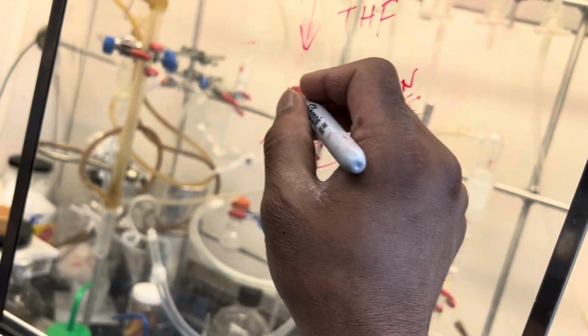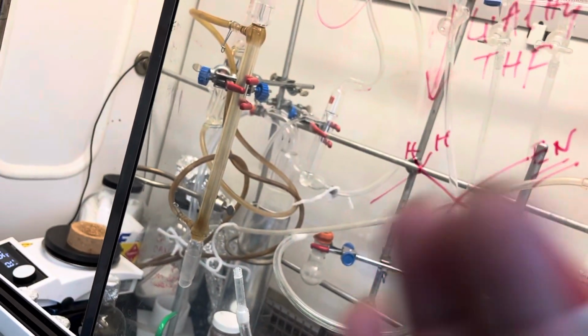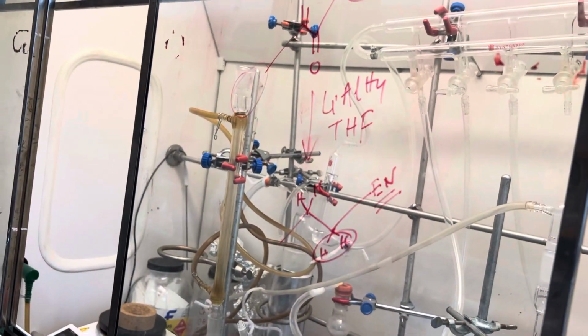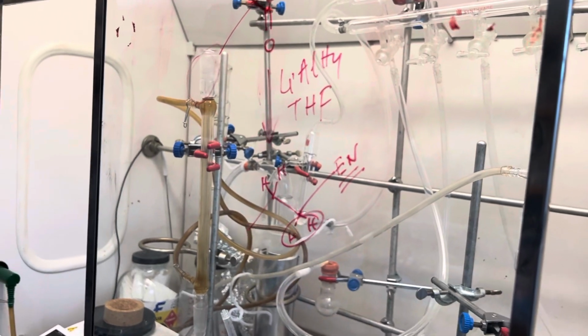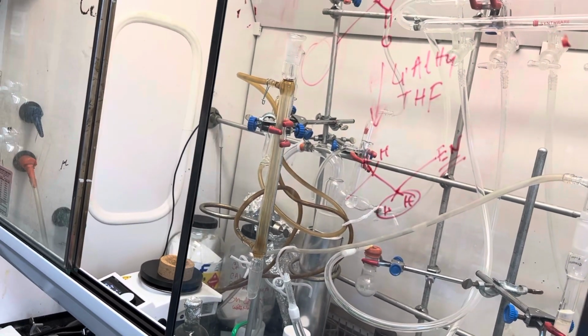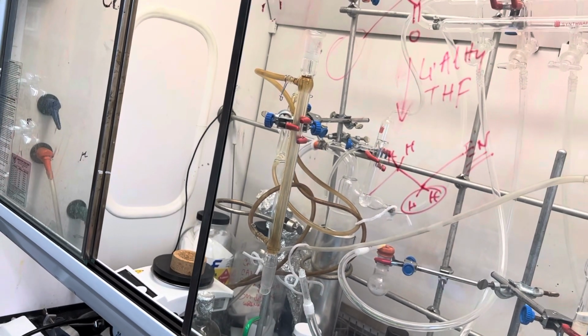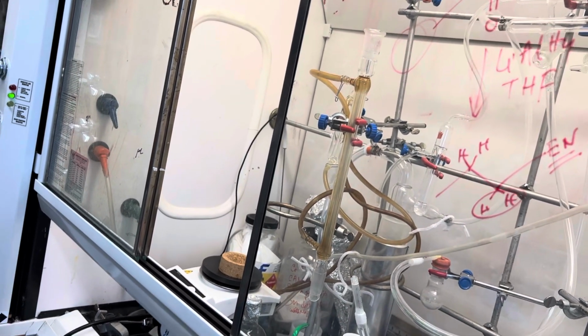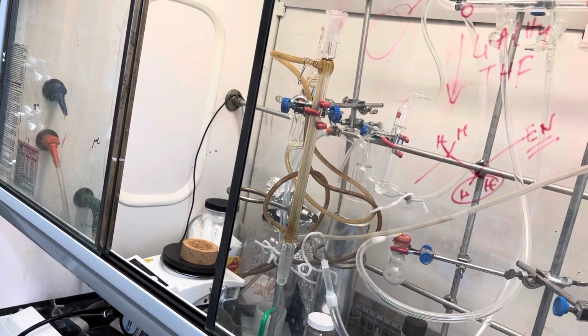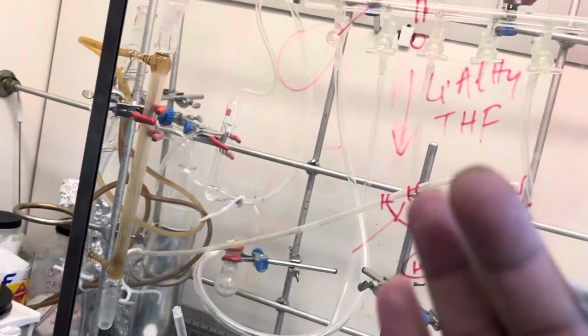But still you might not be sure, and in that case you have to rely on the proton NMR, and also TLC and LCMS. But normally, from the proton NMR, most of the time we can see a signature peak arise or a signature peak removed.